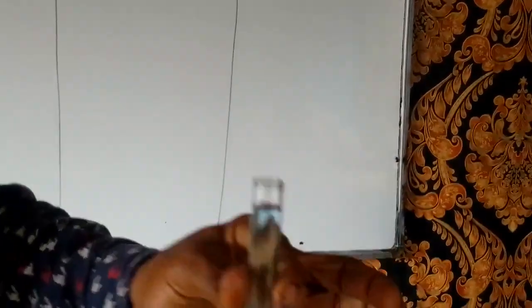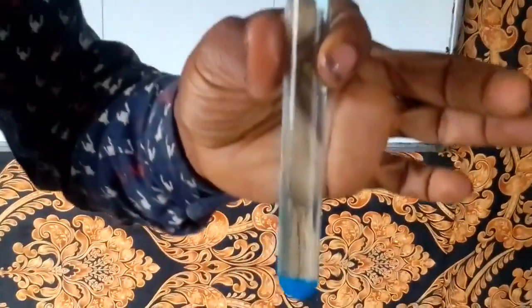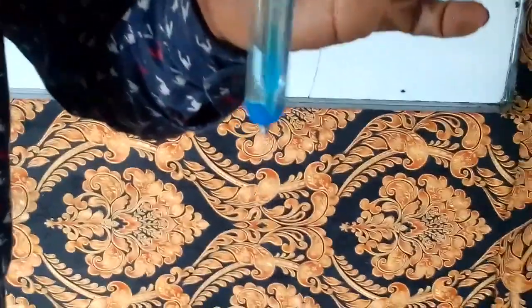The amount of water here is much. We then stir the container to make sure that the salt dissolves completely.